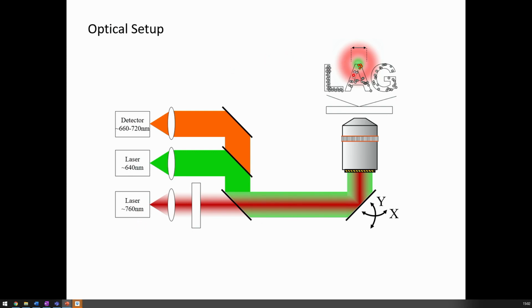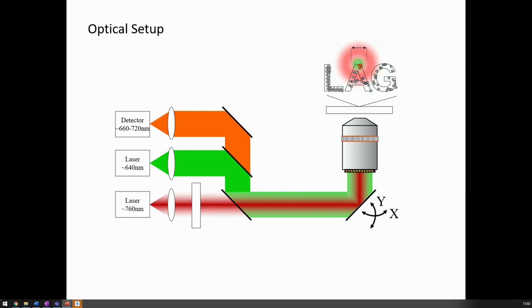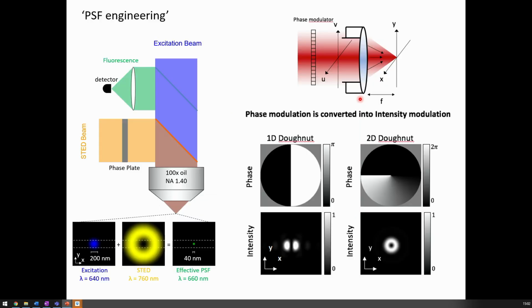And then you switch that on, and so this is the result of it. So if I go back, have a look, and now I switch the depletion laser in like that, and I line this very, very carefully so that you really have the same optical axis. By carefully, I mean really an alignment to the nanometer scales. It has to be very, very precise.